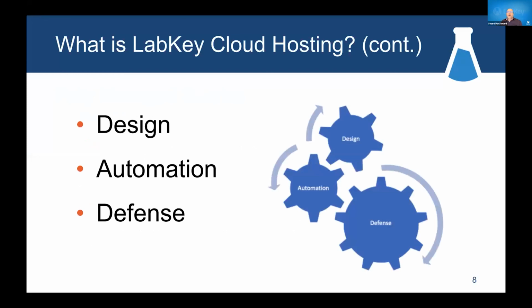My colleague, Isa, is now going to talk about the 3 key approaches that we use in developing and deploying the LabKey Cloud. Hey there. As Stuart mentioned, there are 3 key approaches that we use when developing the LabKey Cloud. They consist of design, automation, and defense. We'll be going through these and talking about them.